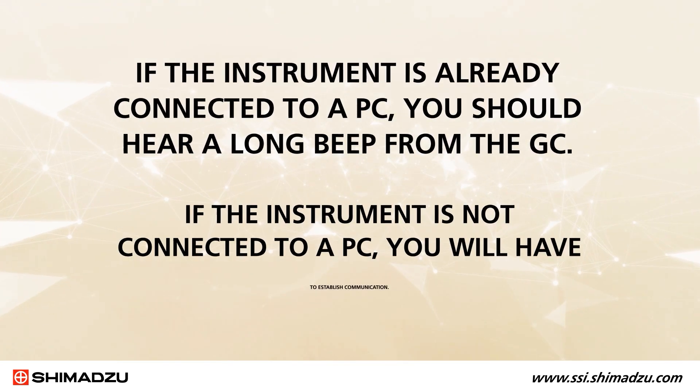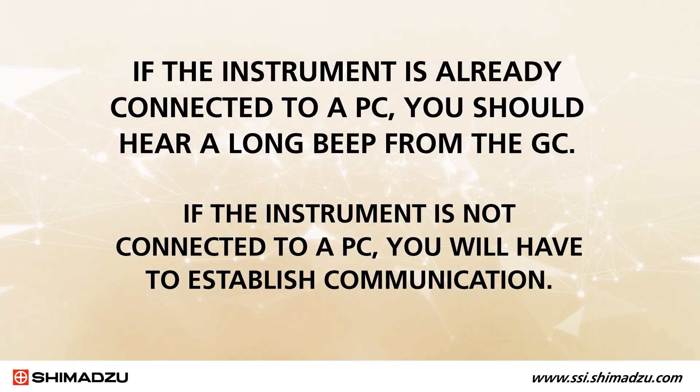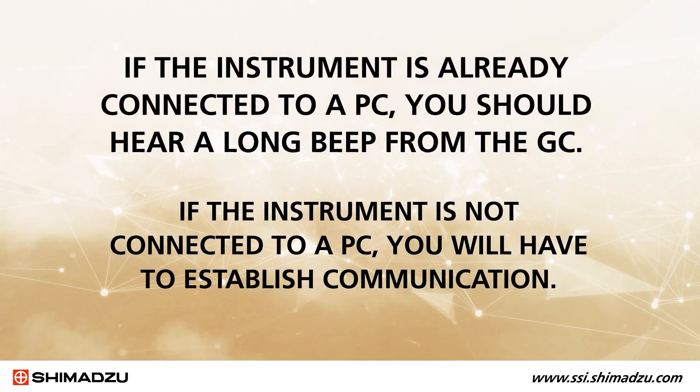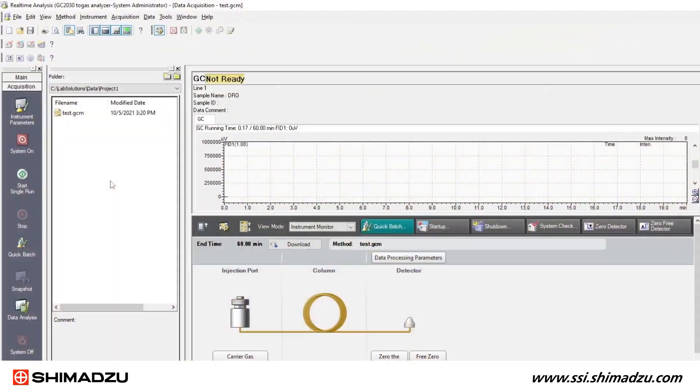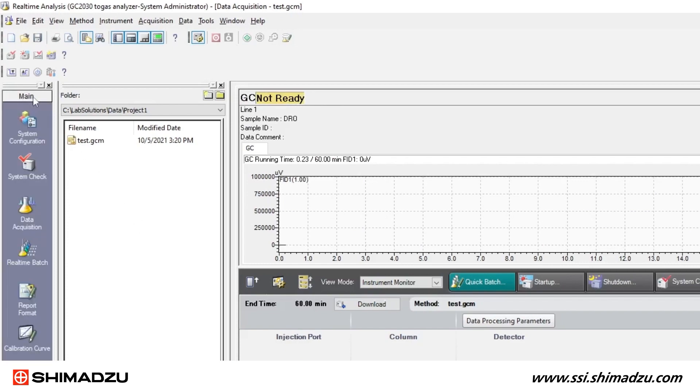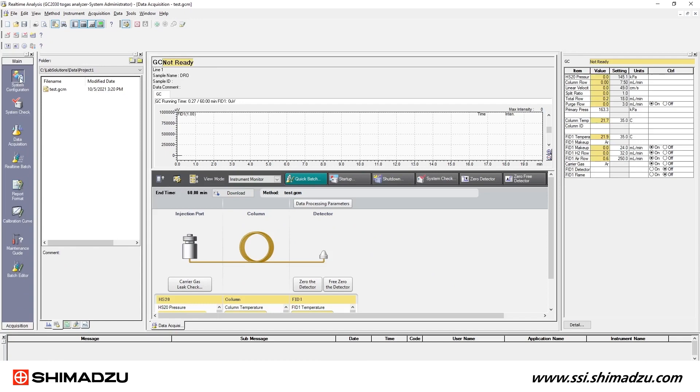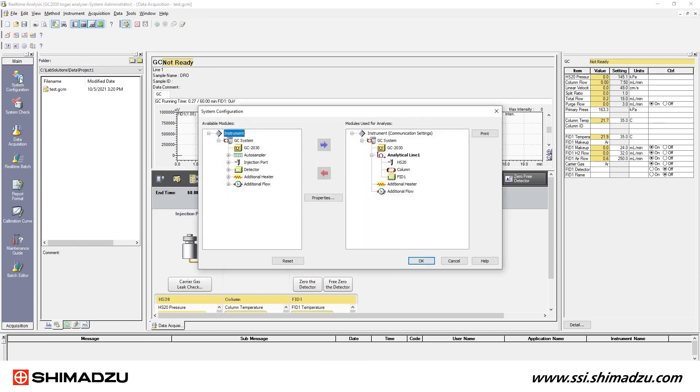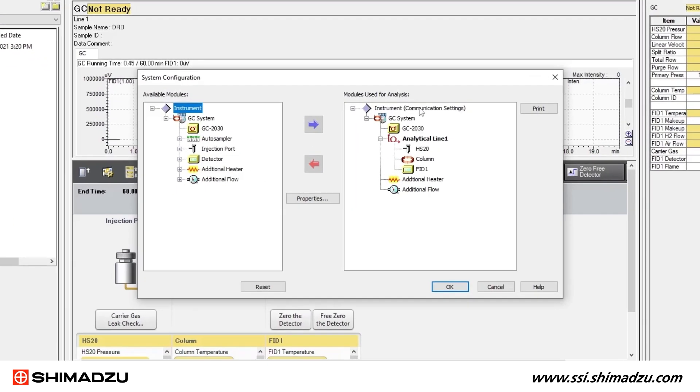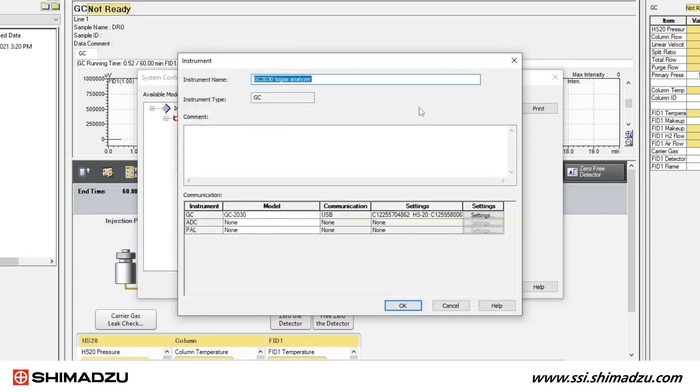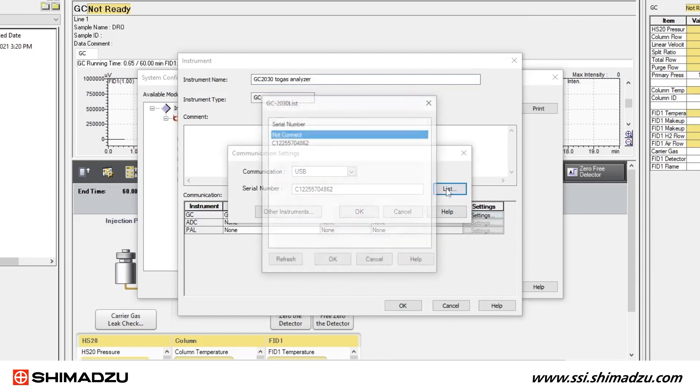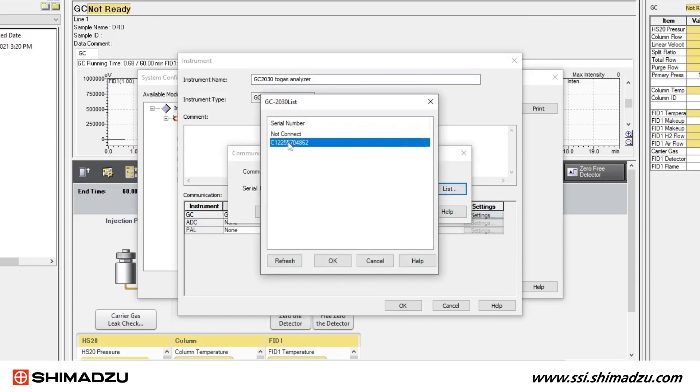If the instrument is not connected to a PC, you will have to establish communication. On the left side of the screen, you will find your assistant bar. Find the main menu option and then select System Configuration. When the System Configuration window opens, click on Instrument Communication Settings. Now select the correct GC model and communication setting for this GC.